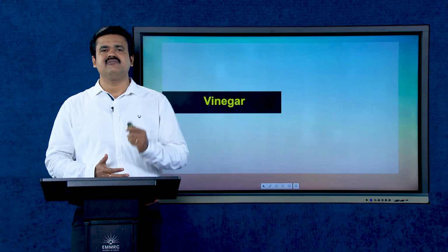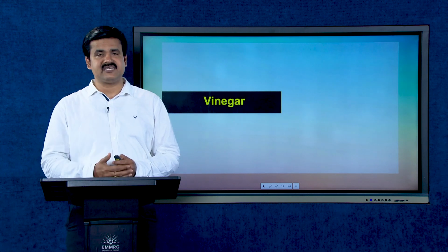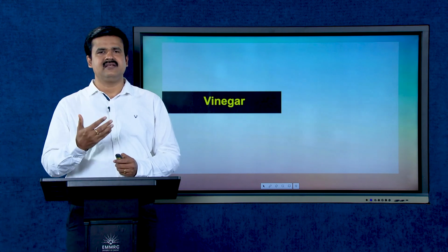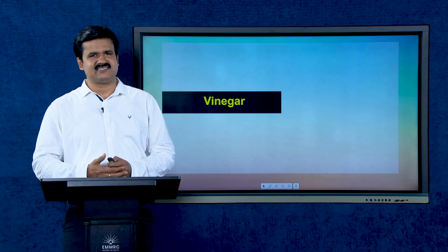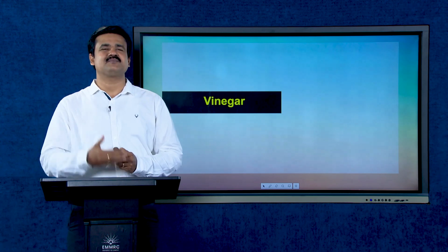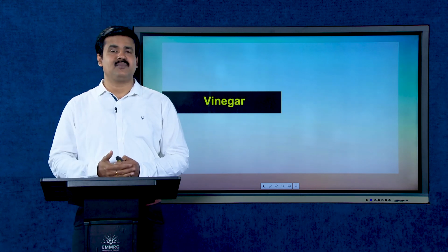First of all, vinegar. You are familiar with vinegar, which is a very good preservative in homemade items, and vinegar is a dilute solution of acetic acid. And in the present experiment, we are going to estimate the acetic acid content in a given sample of vinegar.